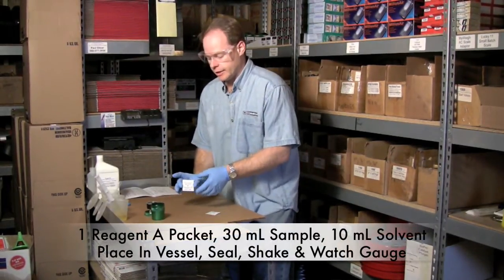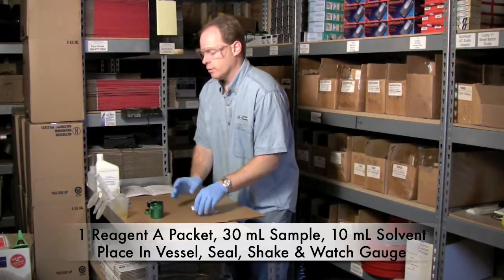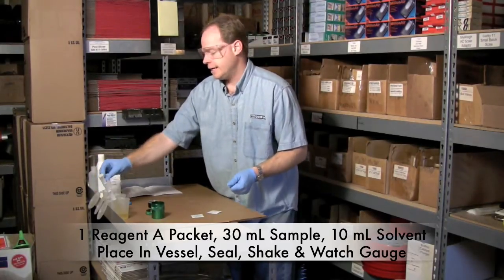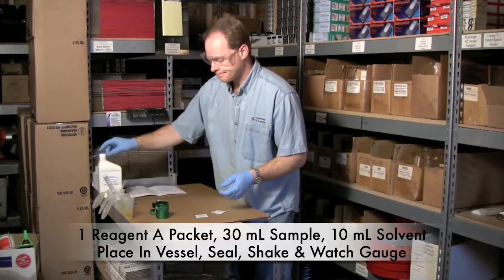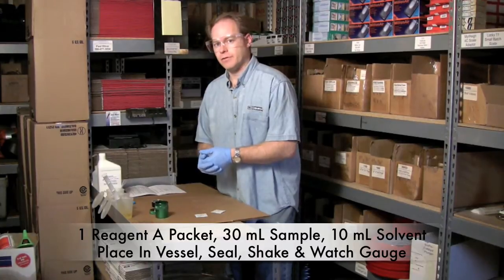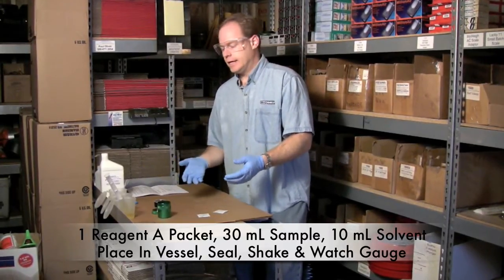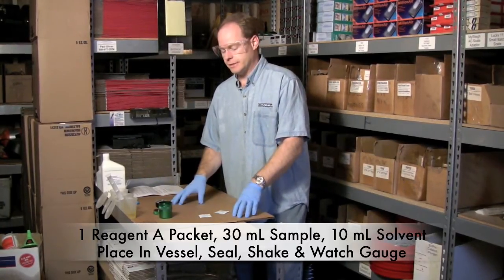To do the test, you're going to take a packet of Reagent A and put it inside the cup. Then draw 30 milliliters of your sample and 10 milliliters of Reagent B, which is the solvent. Put it in, screw it on, shake it a little bit, and let the reaction happen for about five minutes, then see what the gauge says. The kit comes with safety gear and it's important to wear it — I've got safety glasses and gloves on. We are creating a bit of pressure with some hydrogen, so be sure to be safe.